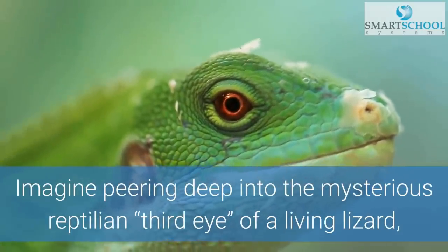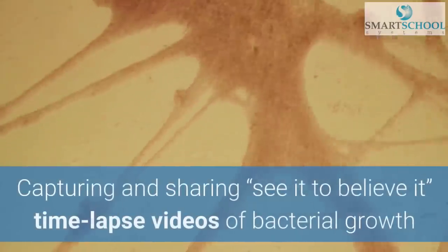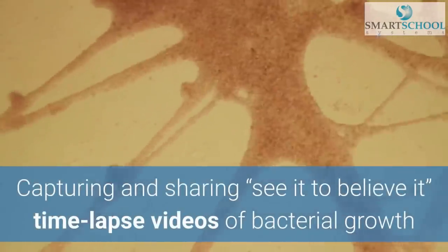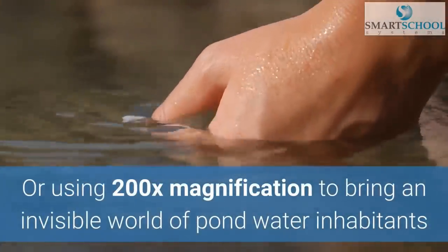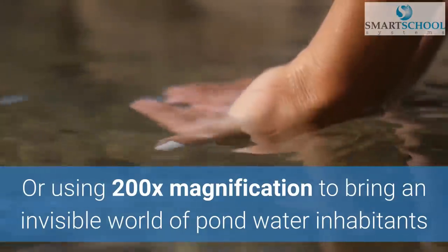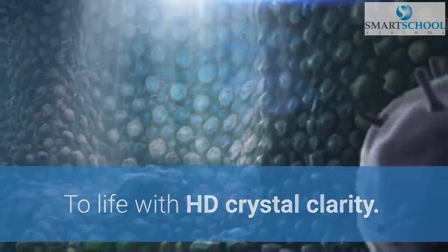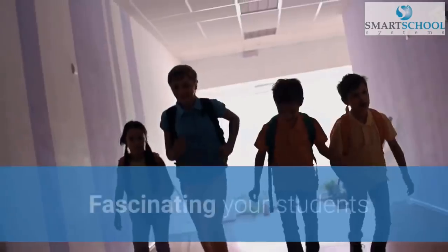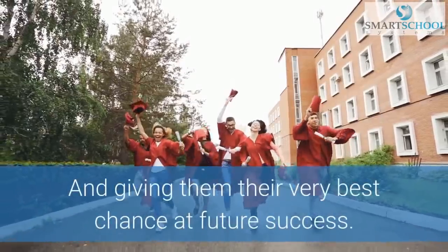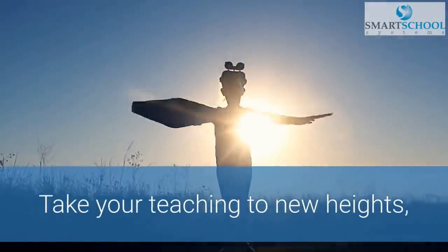Imagine peering deep into the mysterious reptilian third eye of a living lizard, capturing and sharing see-it-to-believe-it time-lapse videos of bacterial growth, or using 200 times magnification to bring an invisible world of pond water inhabitants to life with HD crystal clarity. Imagination is the key to unlocking learner confidence, fascinating your students, and giving them their very best chance at future success. Take your teaching to new heights.